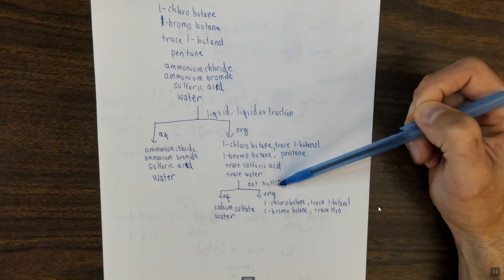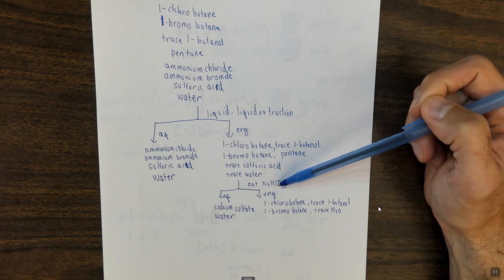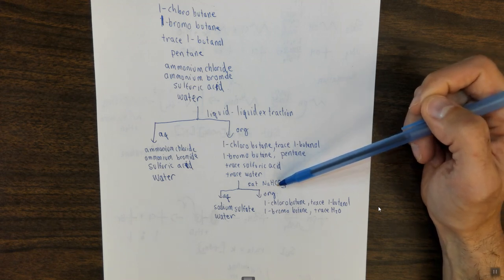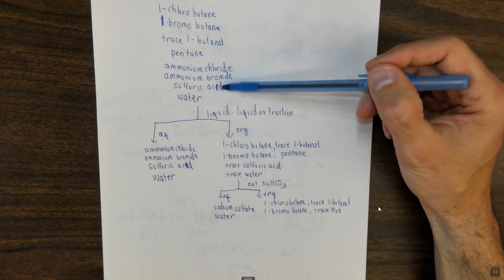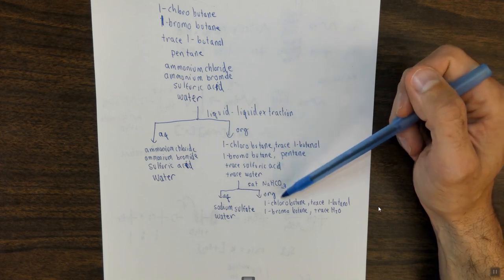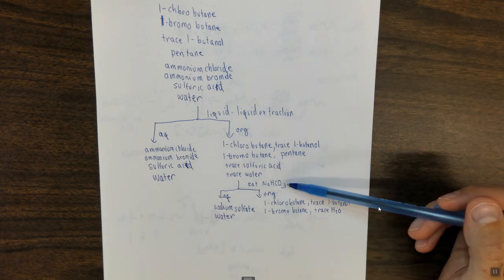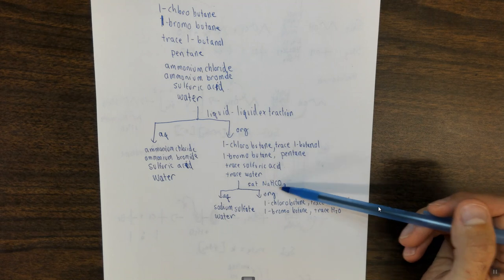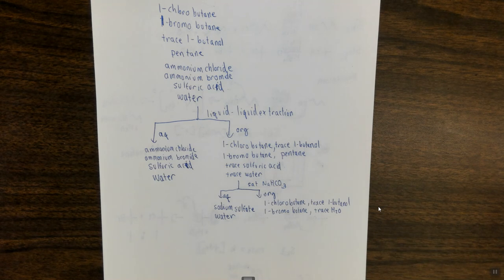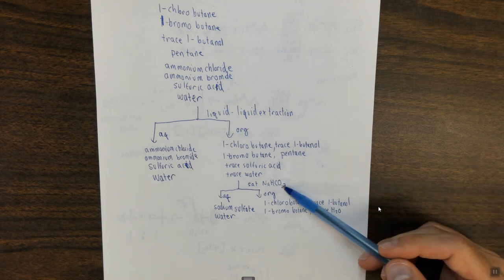So it's really, really important that you do this only after you've gotten rid of the sulfuric acid. Furthermore, when you do add this saturated sodium bicarbonate, you want to gently move the separatory funnel and see if a lot of carbon dioxide bubbles are being generated. If they are, you need to be extremely careful and rethink whether you did this step properly. Then make a judgment call, maybe ask the TA if you need to, of whether you should continue or re-extract with water before adding the sodium bicarbonate. Now, I'm not saying you're going to see no bubbles when you add this, but if you see vigorous bubbling, you need to be careful and get the top off that thing so that the carbon dioxide can just go out into the air. It's not dangerous if it's not a closed container, with this possible exception that it splashes out. So use your judgment and be careful when you're doing this.